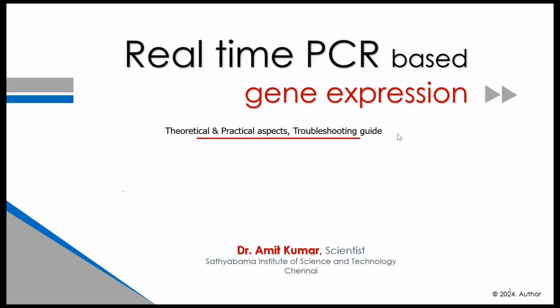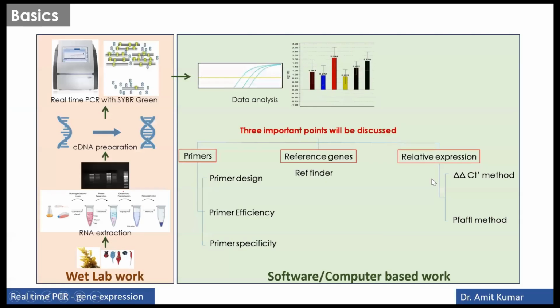So we will quickly look into how real-time PCR-based gene expression can be conducted. What are some of the theoretical aspects, practical aspects, and the troubleshooting, right? If we look into the basics of real-time PCR, there are two major divisions you can make. One is the wet lab experiment, and the second one is the software or the computer-based work.